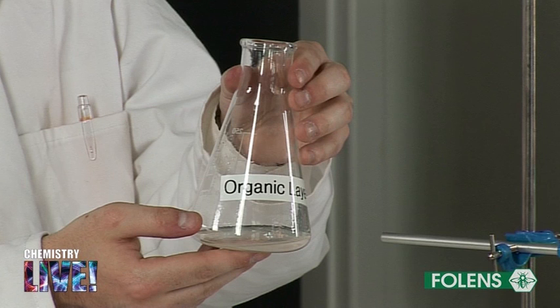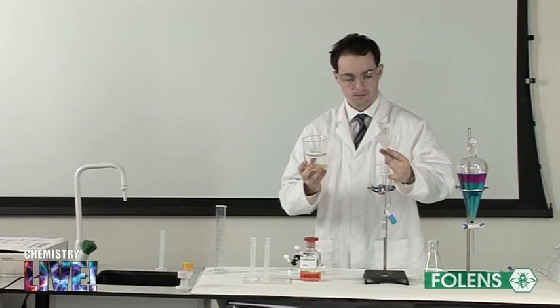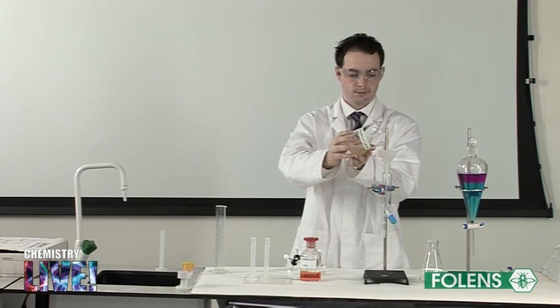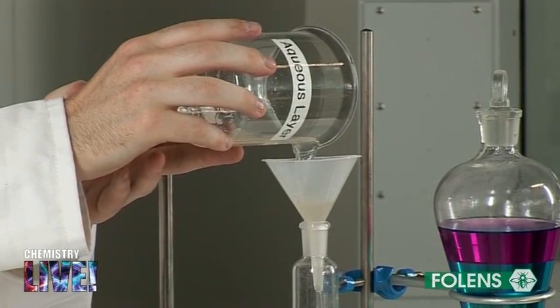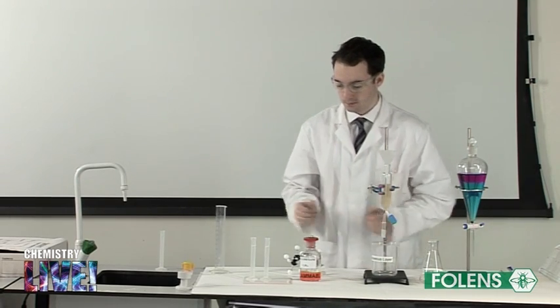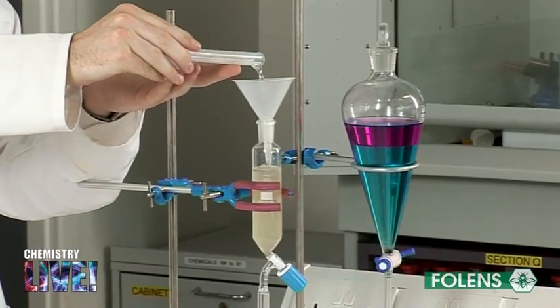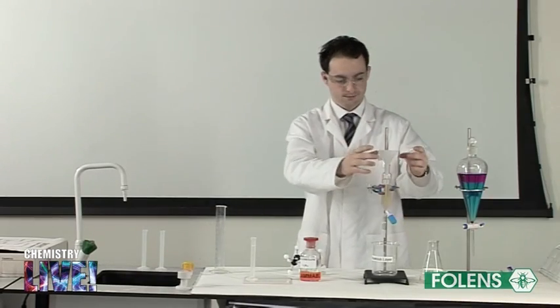You must, however, repeat the washing process 2 more times in order to extract the maximum amount of oil from the emulsion. Check that the top of the separating funnel is closed. Pour the aqueous layer into the separating funnel and add a 10 cm³ portion of cyclohexane solvent to the separating funnel. Repeat the same steps to obtain the second washing.